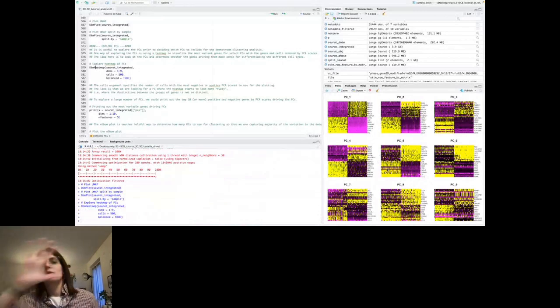In this case, you could plot also 100 principal components, and you could choose to include in your UMAP calculation for clustering the principal components up to the component which becomes all noisy, let's say. Because you see that the first is very clear, the delineation of the positive and negative. So you have one cluster, this positive and this negative, and all the others in the other cluster. You have to imagine it at one end of the axis and the other end of the axis, okay?